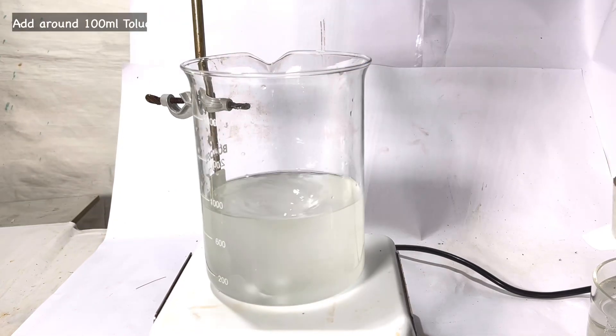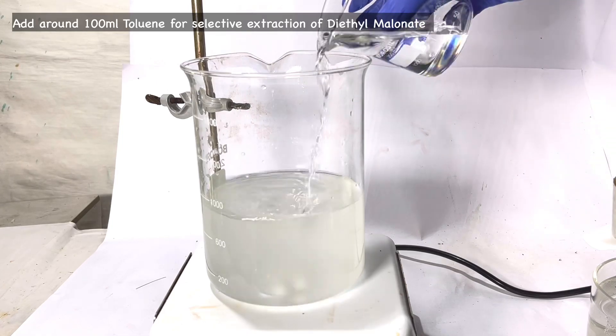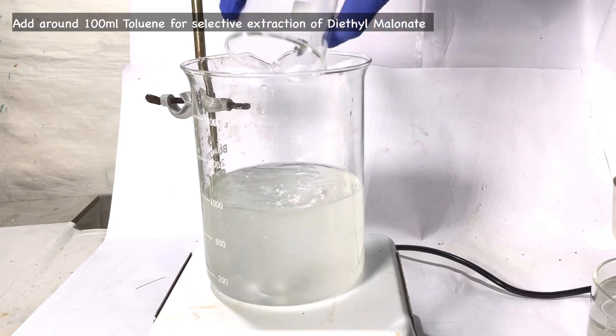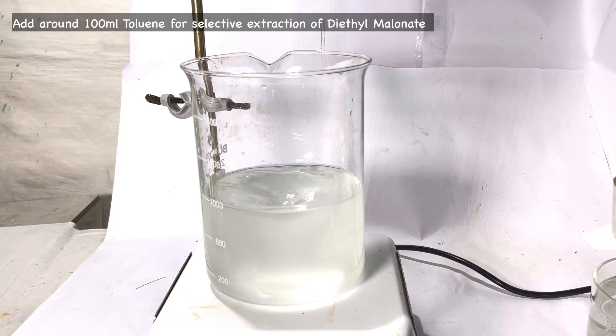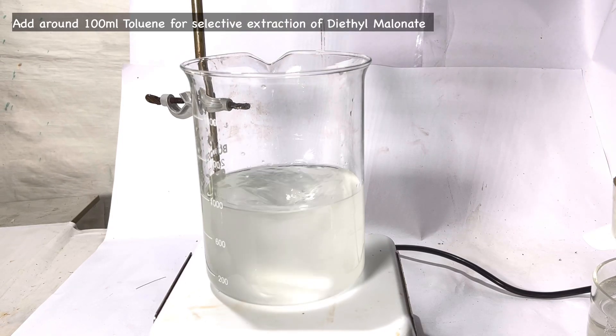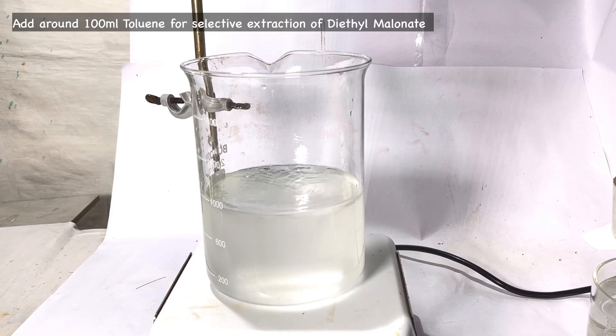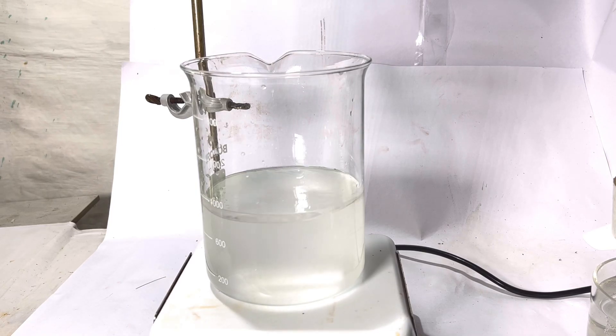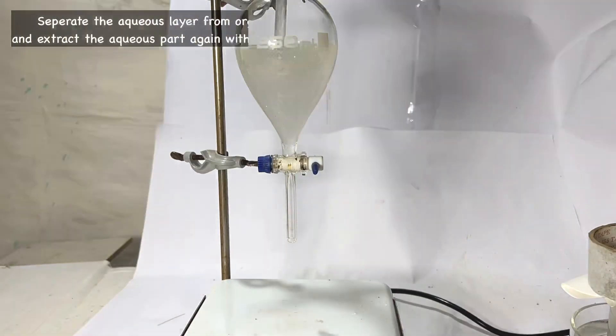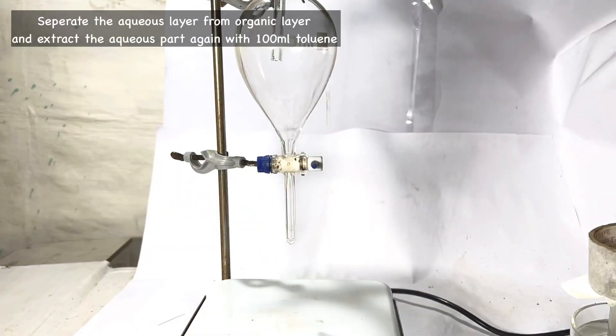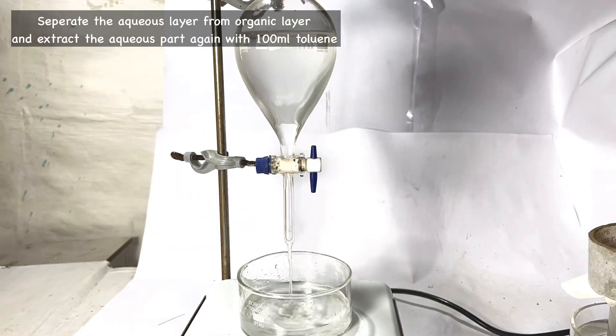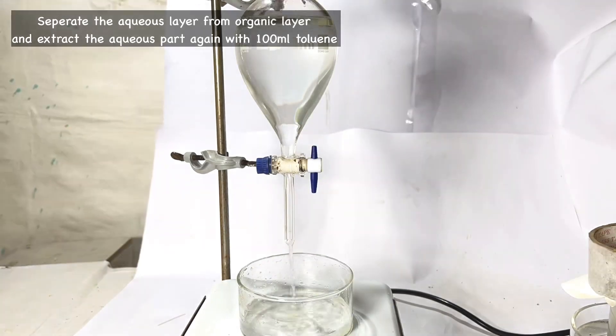Next we begin the solvent extraction of diethyl malonate. Initially around 100 milliliters of toluene was added to the beaker and it was vigorously stirred. Diethyl malonate has more affinity to toluene than the aqueous layer, hence diethyl malonate is selectively dissolved into the toluene layer. Later the contents of the beaker were poured into a separatory funnel and the upper toluene layer was collected. The lower aqueous layer was extracted a second time with toluene and the second toluene layer was combined with the previous toluene extract.